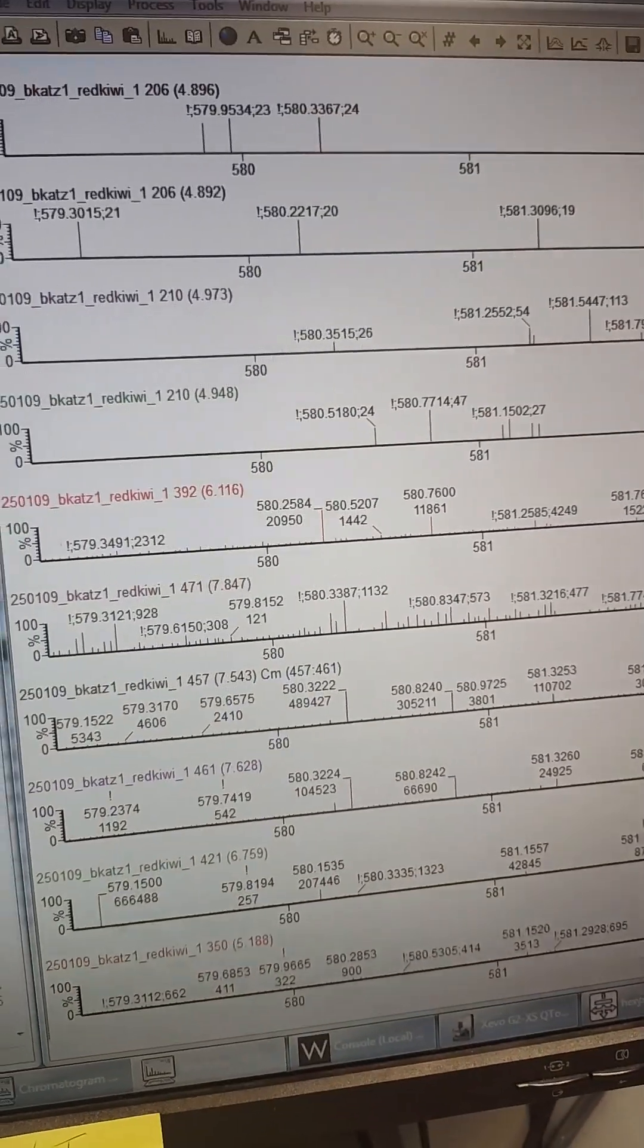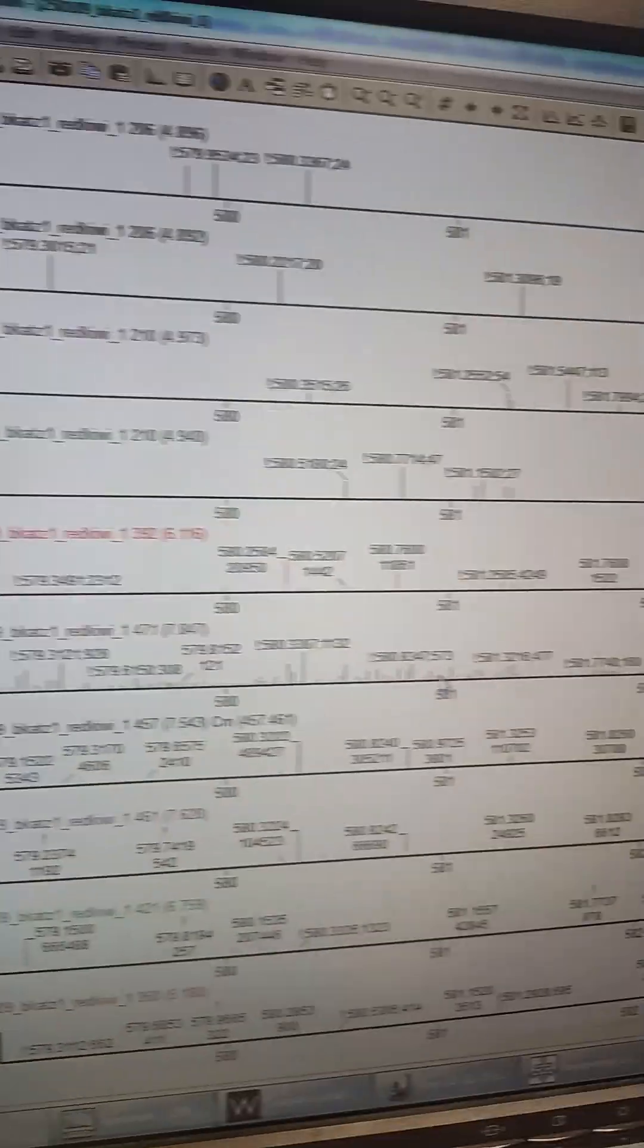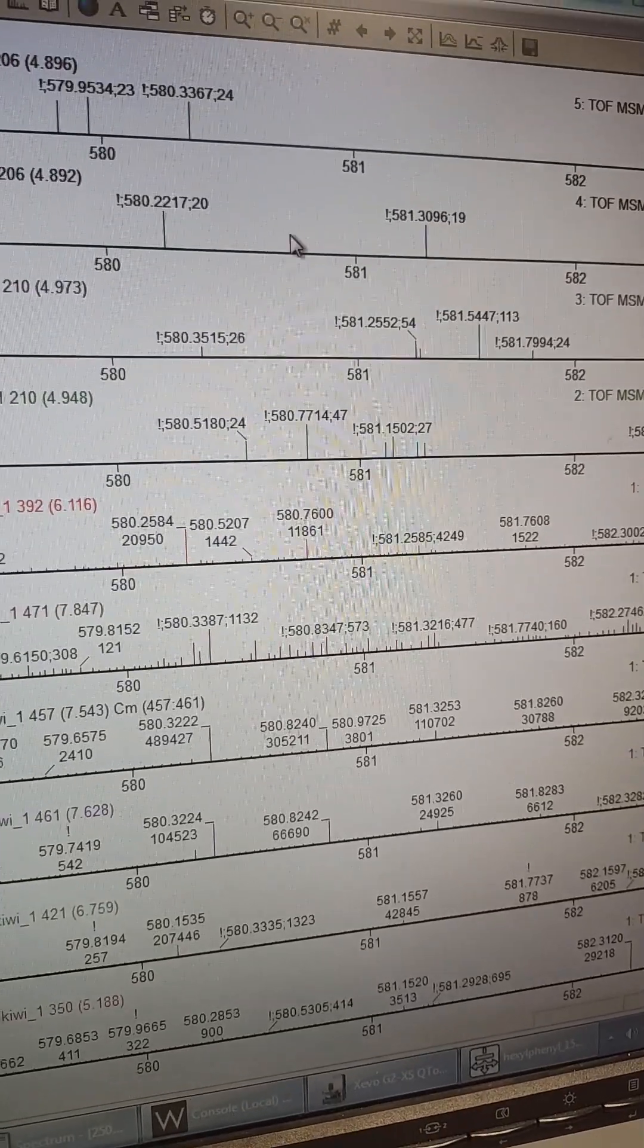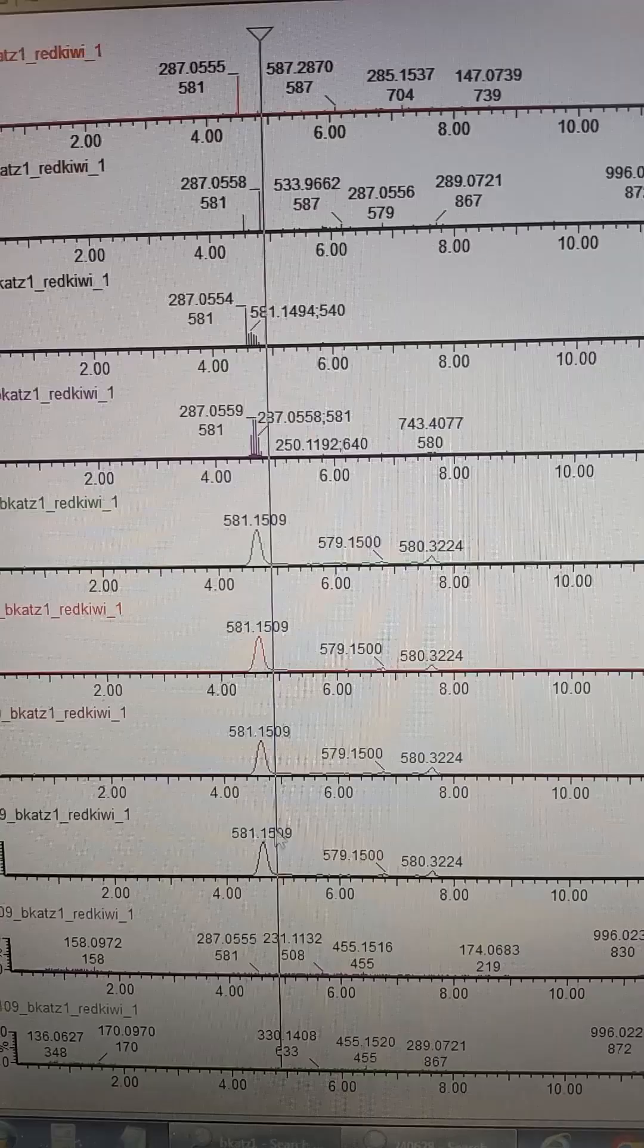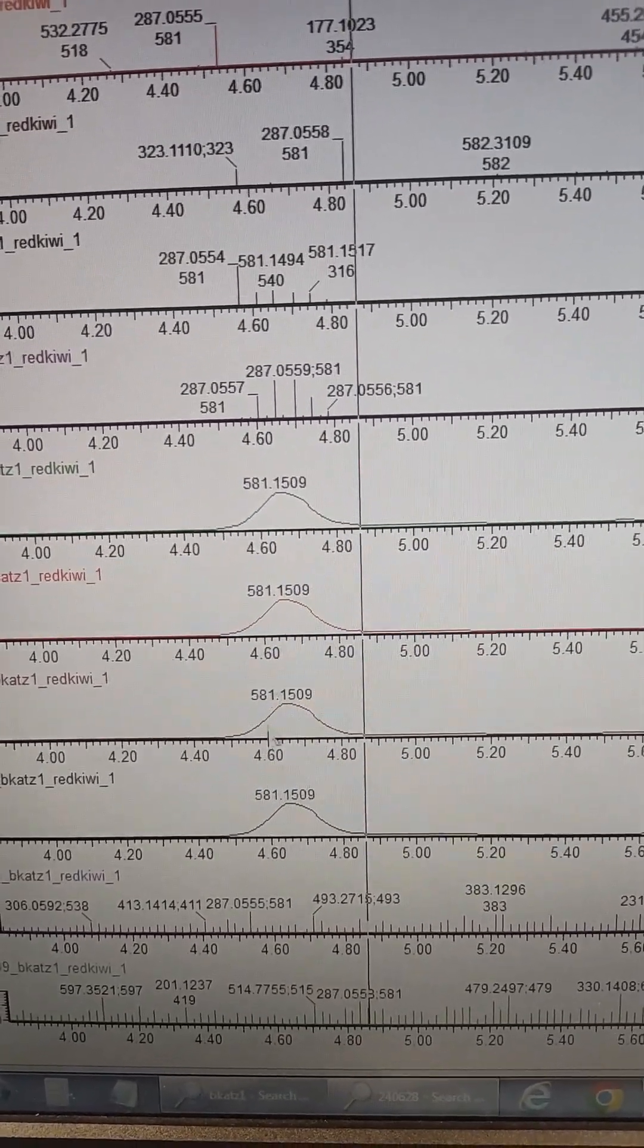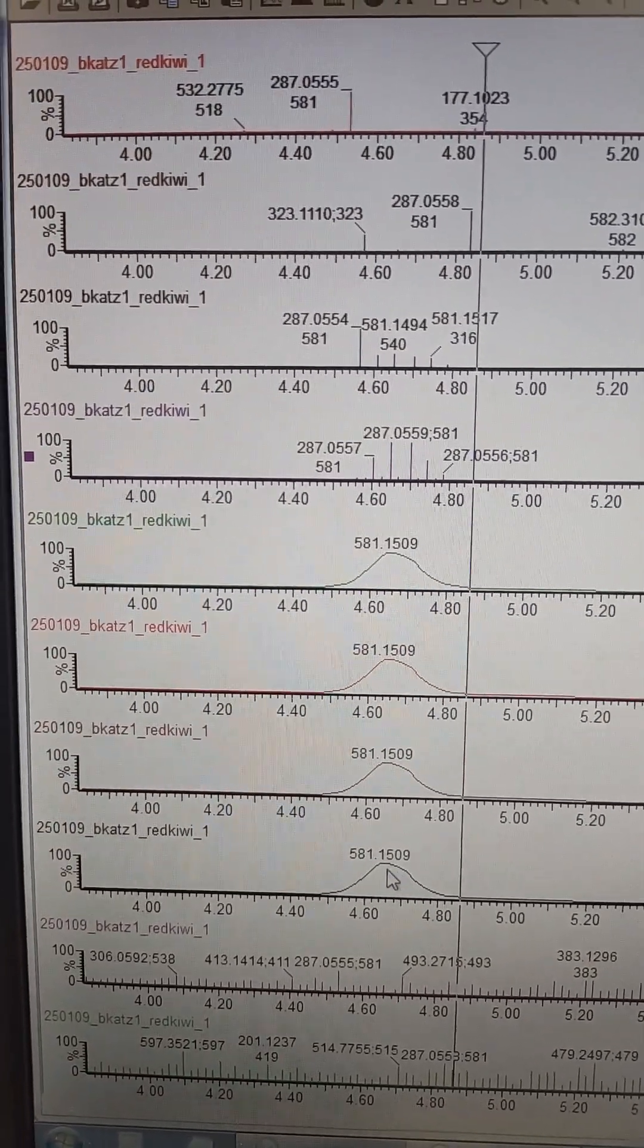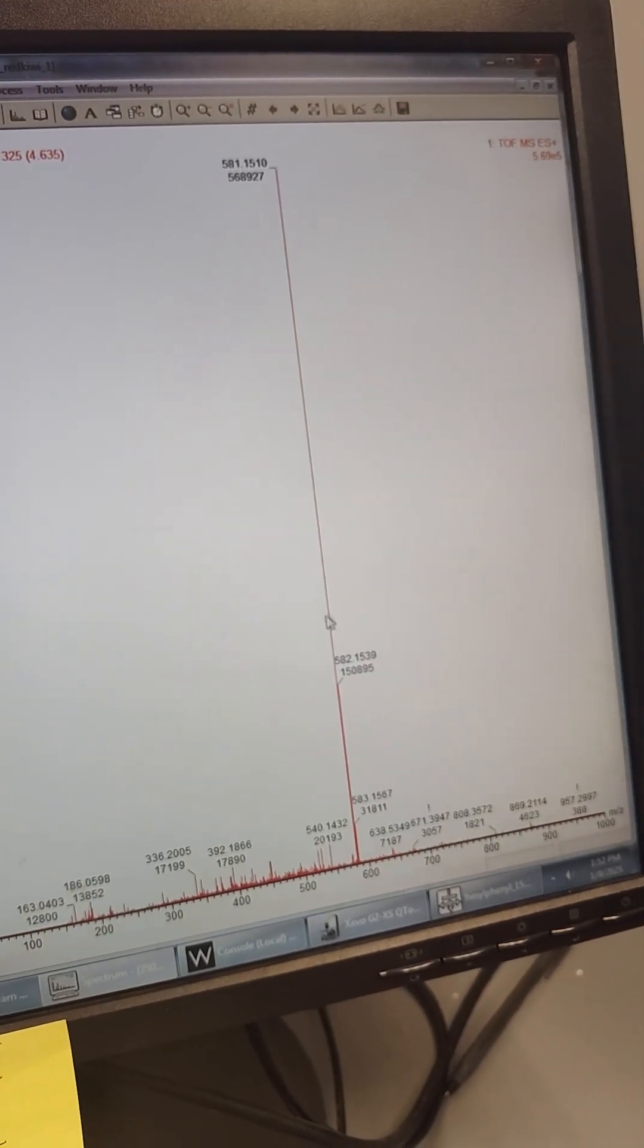The way we're going to do this is we're going to pull up both the MS and all the MS/MS data. Because we don't know if it's fragment. We're going to extract out this area around 581. So it's supposed to be 580.9. And so then we're going to see areas where we're not only seeing it in the MS1, we're also seeing it in the MS2. I'm liking this one right here.